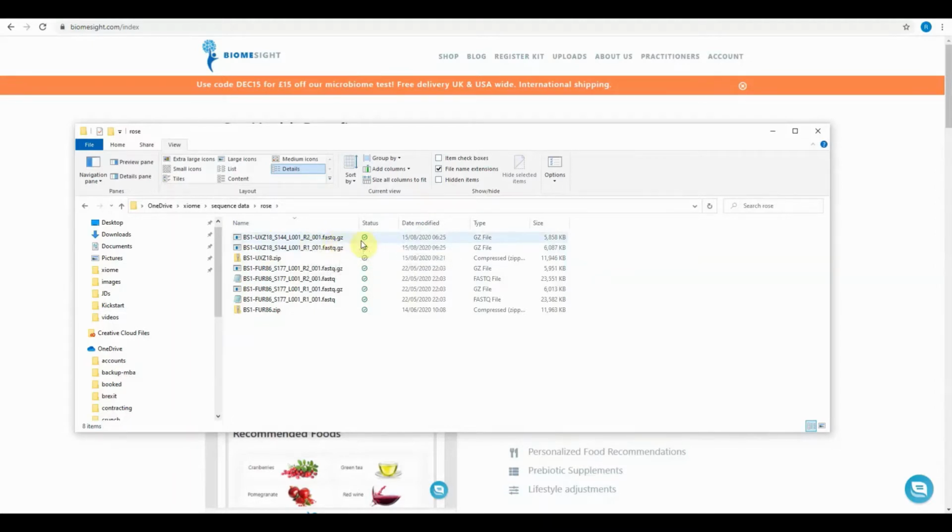Either the individual files, for example, these 2, or if you want, you can combine that into a single zip file, but it's no longer necessary for you to have special software to be able to combine these. We can now take these individual files. Okay, so let's get to it then.